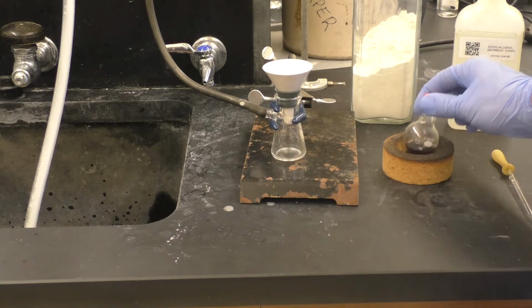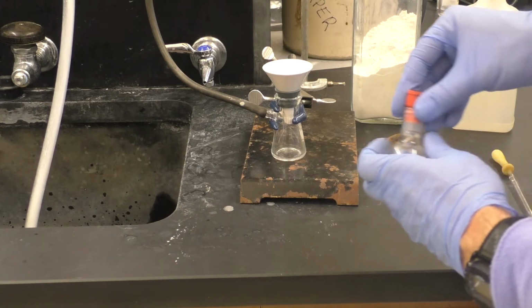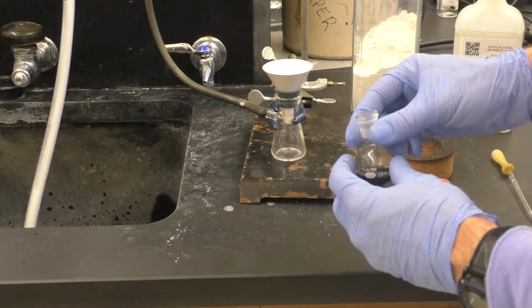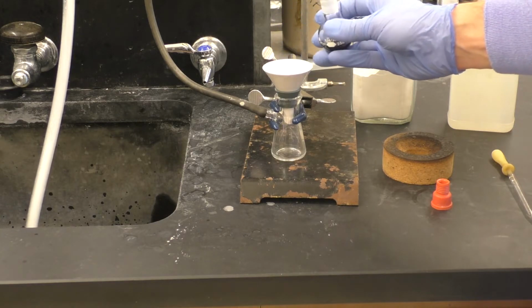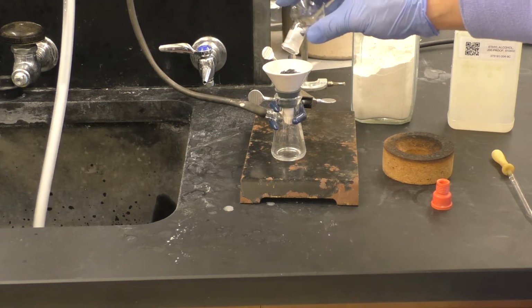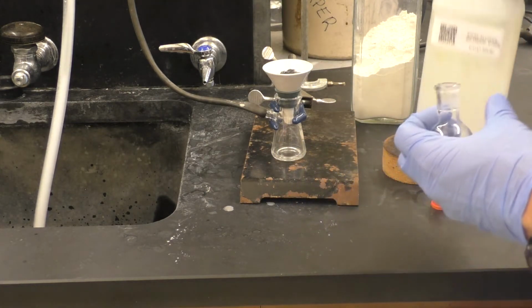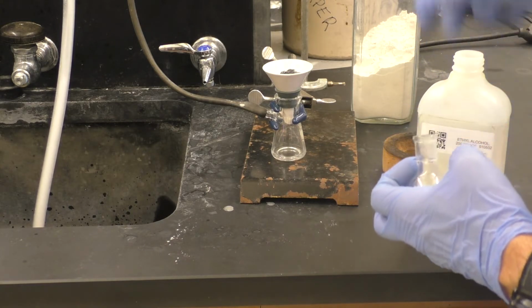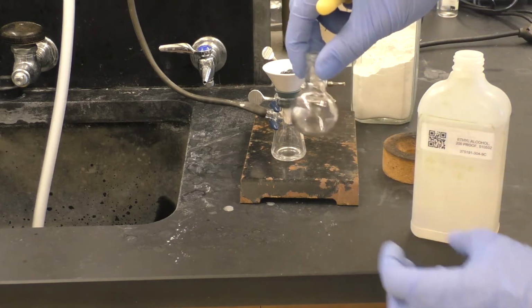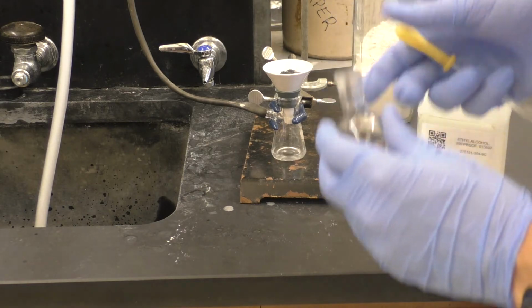So I'll take my round bottom flask that has the material here. We'll open it up, remove the septum, swirl that material and pour it directly onto the Celite pad. I'll then rinse the remaining round bottom with some absolute ethanol, swirl that around, add that onto the Celite pad, and do it one more time.